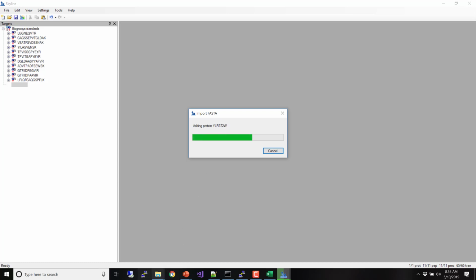There's 2 webinars on this, so you can come back and follow these recordings, but there's also more recorded webinars. But basically, at the very high level, it's get your settings right, import the things you want to target and make sure that you have all your targets set up.